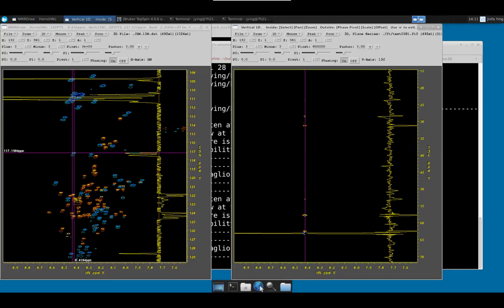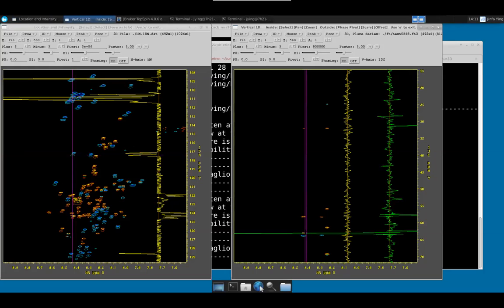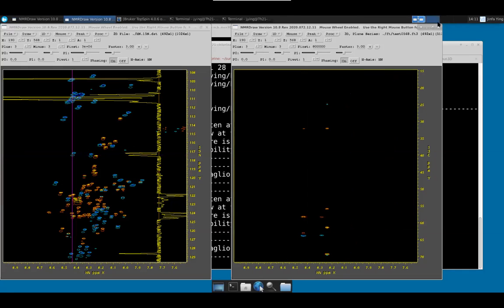You see that? And if you get the vertical line, you see the difference in the chemical shift of the C alpha, and over here as well, preceding and intro residual. And anyways, this is how we measure the deuterium isotope effect.